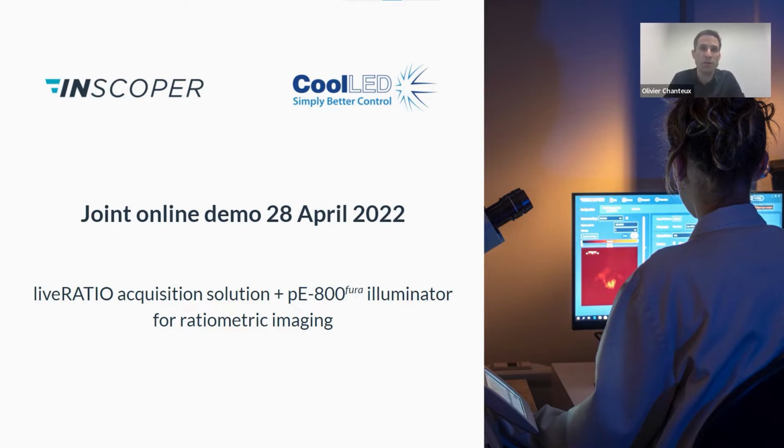In a few minutes, we will join my colleague Julien at the microscope. Before meeting him, Joe Winston from coolLED and I will present some introductory slides. During the whole presentation, feel free to write your questions in the chat. We will answer them after the demo.